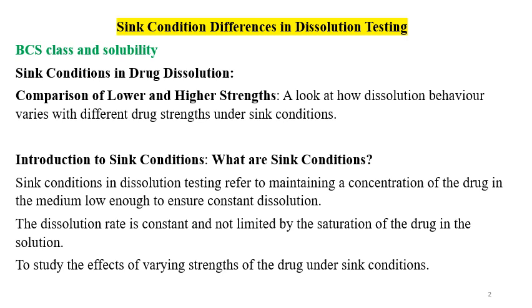Sink condition in dissolution testing refers to maintaining the concentration of the drug in the medium at a low concentration which is enough to ensure constant dissolution. When the dissolution test is done with sink conditions, the dissolution rate is constant and not limited by the saturation of the drug in the solution.